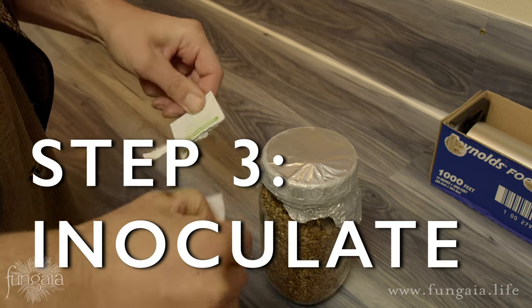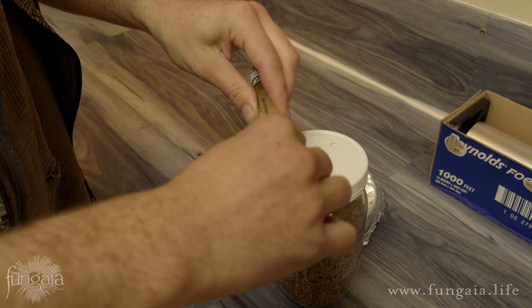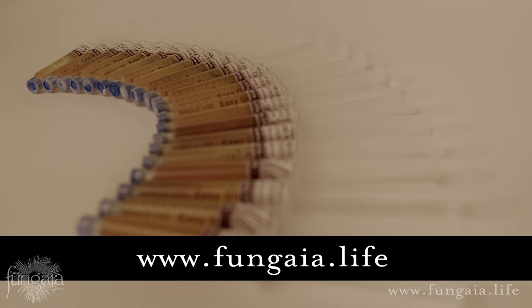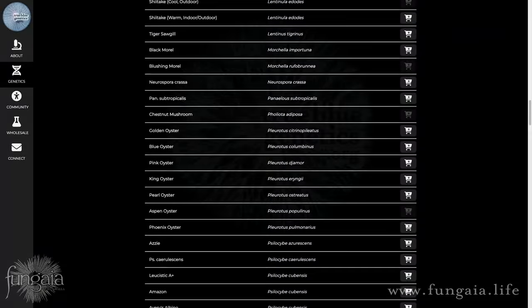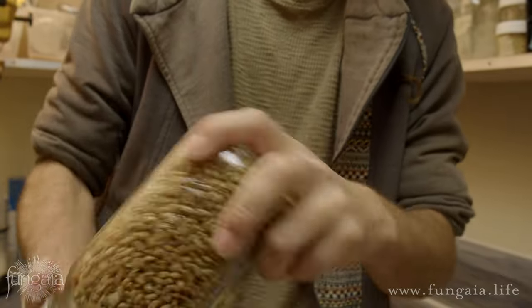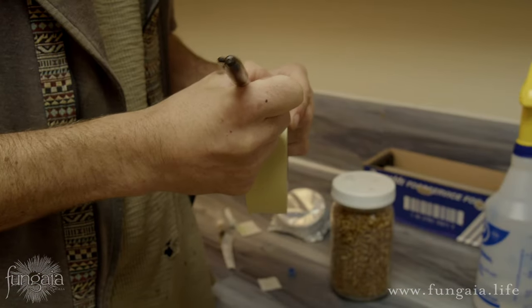Now that we have our perfectly prepared grain spawn, we're ready to inoculate it using a liquid culture syringe. Liquid culture is by far the easiest, most accessible, most reliable, and most consistent way to start your grain spawn. Check out my video on how to use a liquid culture syringe for more information. Visit our partners at truebluegenetics.org for a huge selection of the most consistent, clean, vigorous liquid culture on the market — use the coupon code FUNGAYA at checkout. Be sure to mix the jar as thoroughly as possible after inoculation to distribute the liquid culture throughout the grain. Taking a little extra time to do this now will save you from needing to break and shake the mycelium later, and it also benefits the fungus and cuts down on your incubation time.